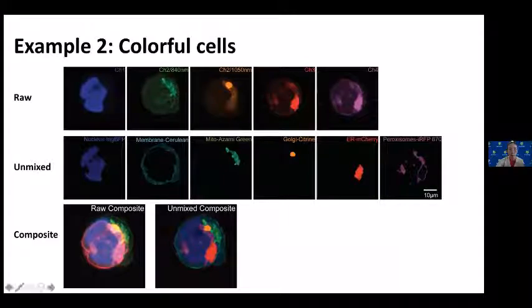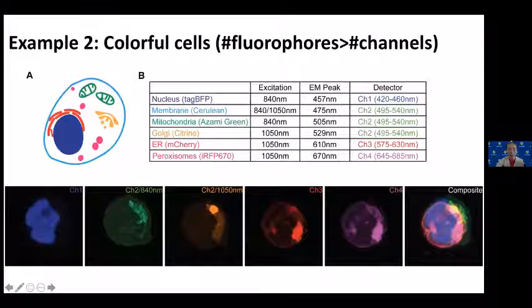For this example, which is a more complicated example that I didn't highlight here, we were actually able to scan twice with two different lasers and detect under the same detector. We usually call that a sequential scan under our system. In that way, we can consider it as what you said, like two detection scenarios. It is not very easy to do with multiphoton microscopy, mainly because the laser itself is very expensive, and most multiphoton microscopes on the market have only one laser, so at one time you can only use one wavelength. For my system, we have two lasers, so the maximum you can get is excitation at two different wavelengths.